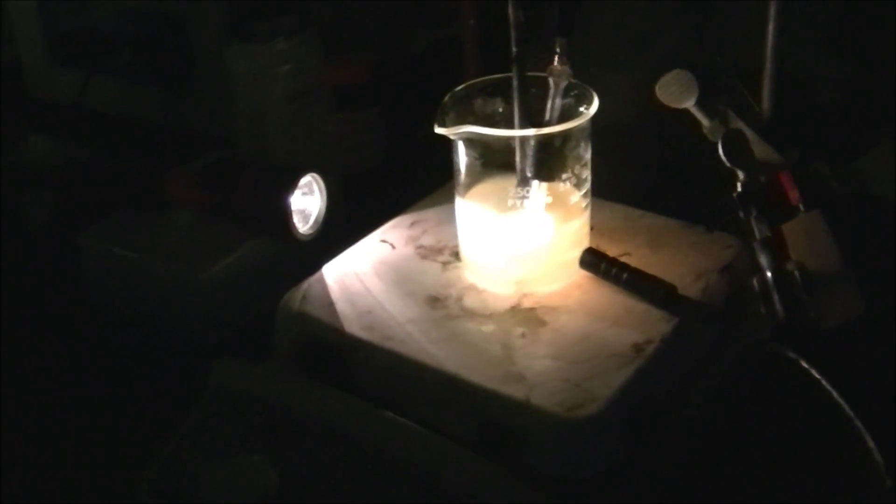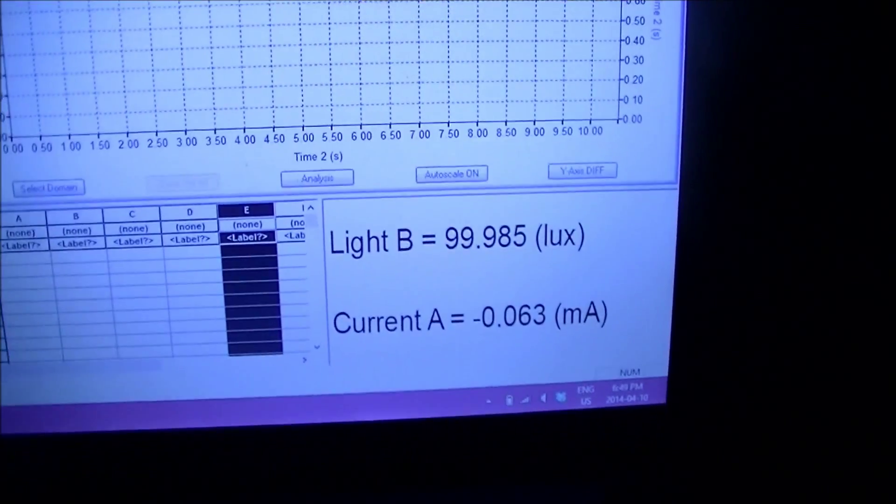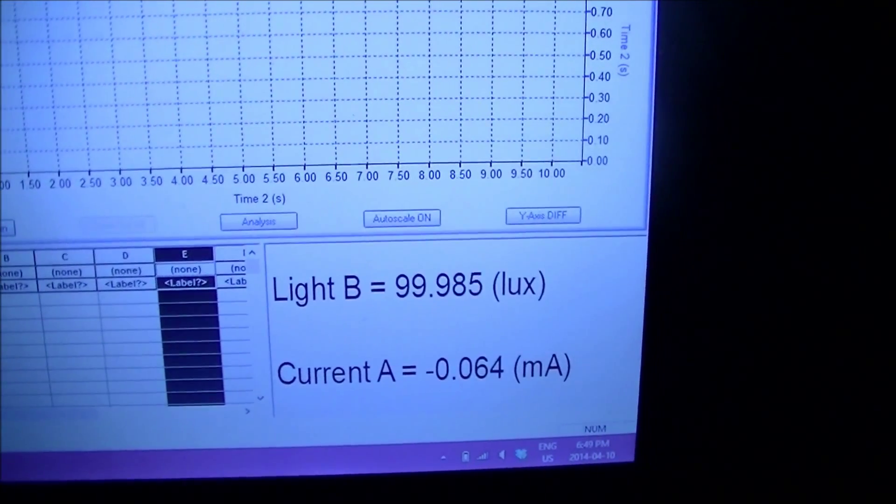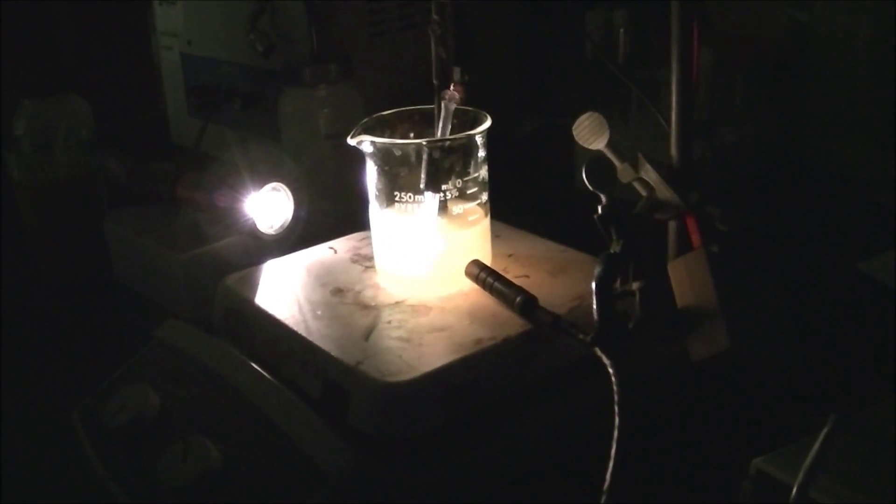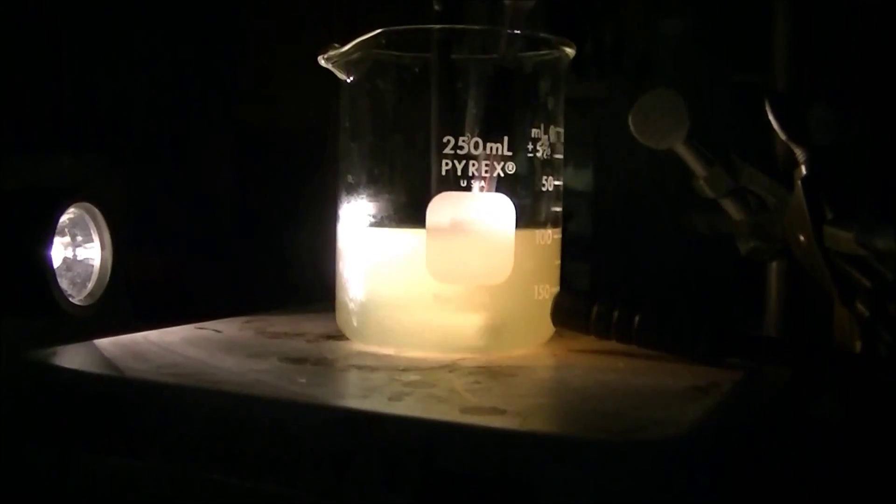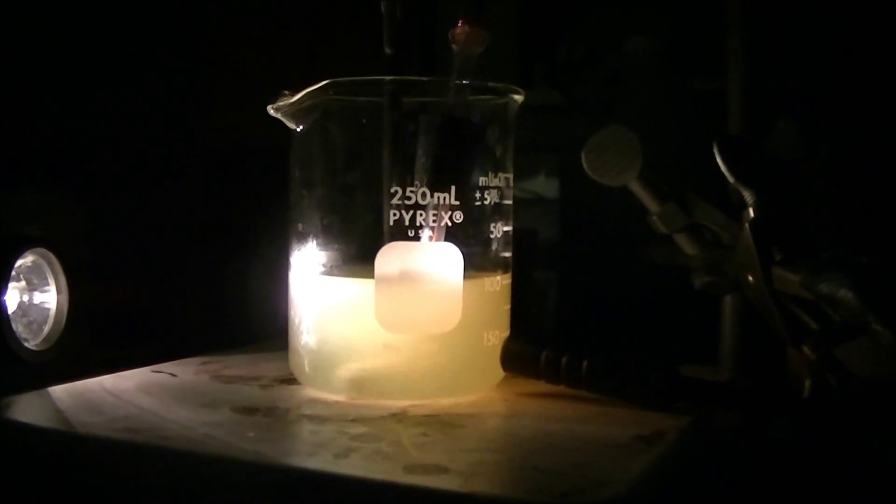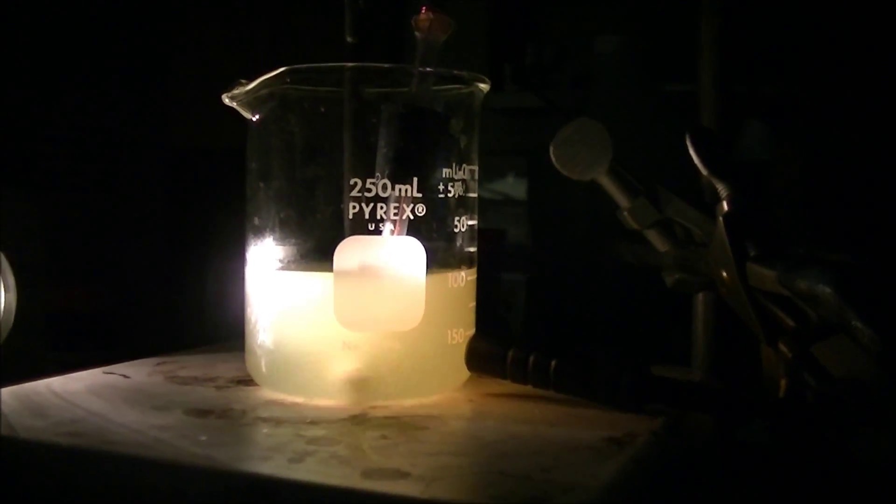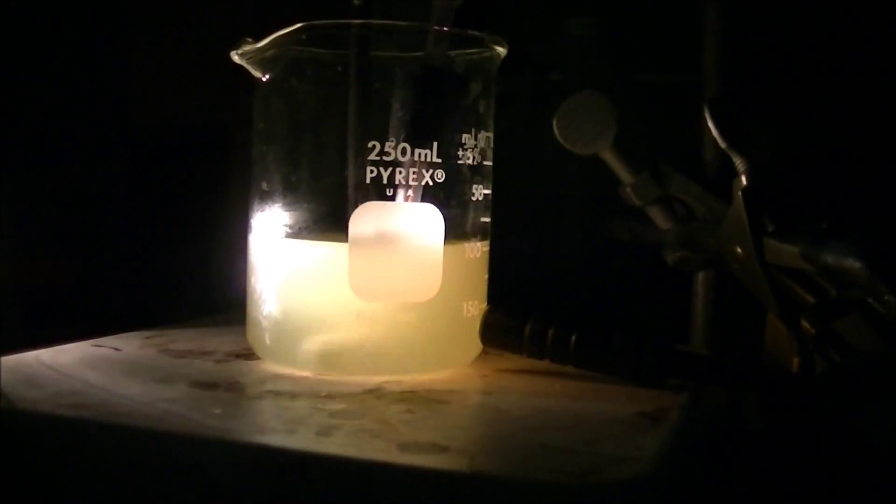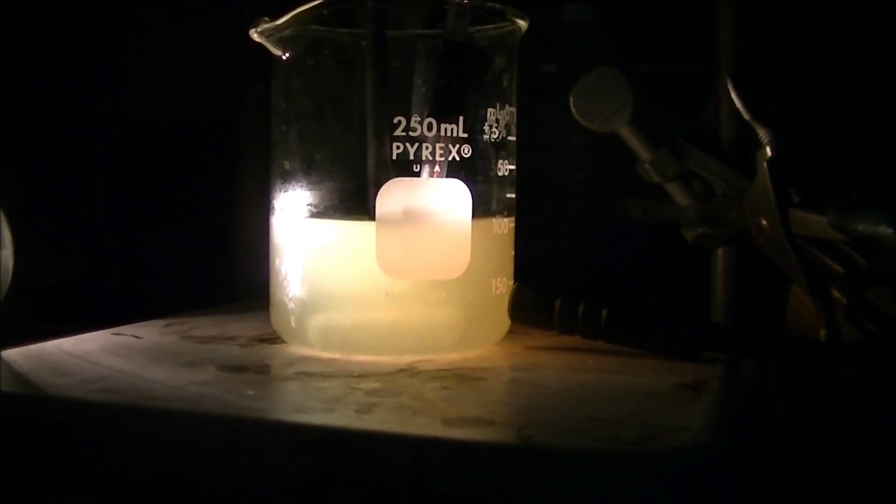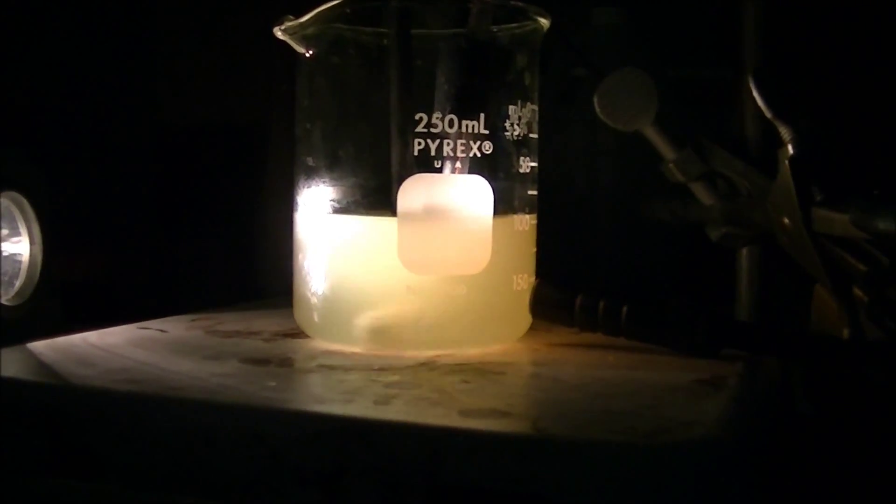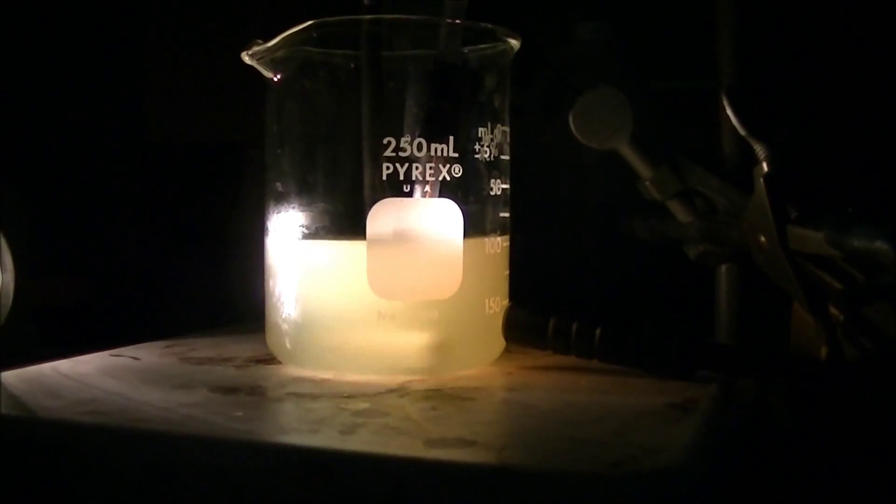Here we are, we're ready to start now. The flashlight is shining right on. We have it hooked up. And as you can see, our light is pretty much steady at 99 point something, so it's pretty high up there. I'm going to click start and we're going to start this reaction. You can see it's a nice kind of orangish, diluted orange juice because that's basically what it is right now. Our light is still looking good. We're just going to wait until we see it turn this blackish color.